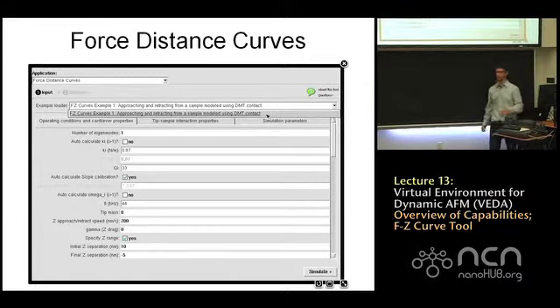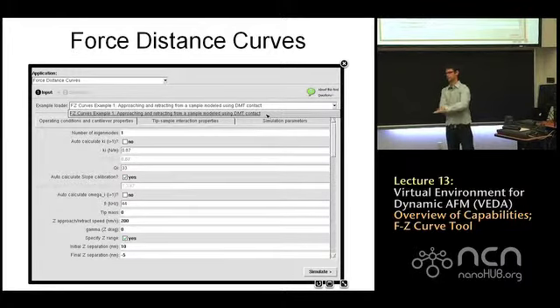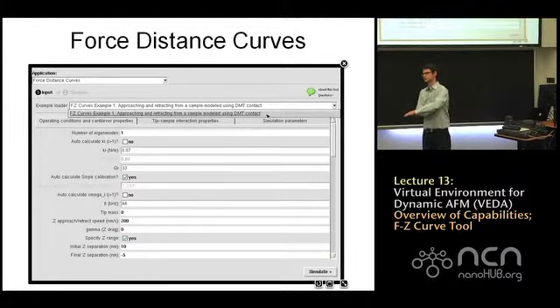We loaded all these inputs, but they're on this page. Also, there are parameters like the speed at which we approach the sample with the base, and the initial and final Z displacements. This is not the same thing as a tip sample gap. We're now specifying how the piezo actuates the cantilever in terms of the Z displacement.